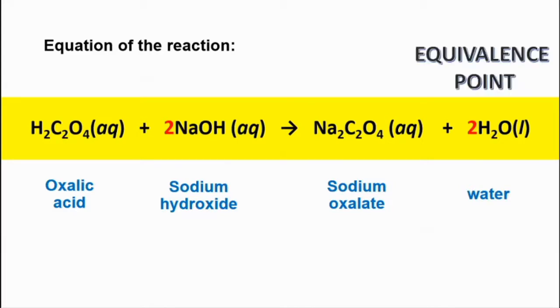Okay, so this is what we call the equivalence point. Equivalence point means the reactants have completely reacted according to the equation, or according to the stoichiometric relationship between the reactants in the reaction. Okay, that is what we call the equivalence point.